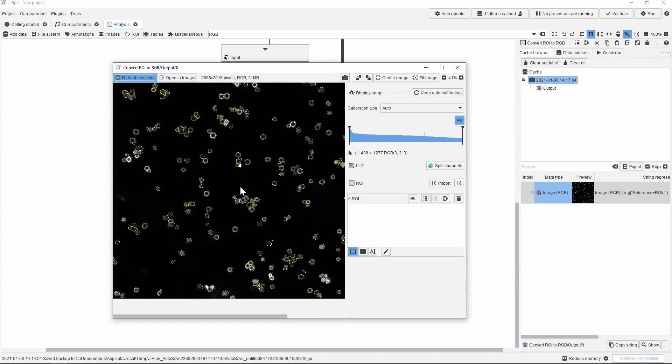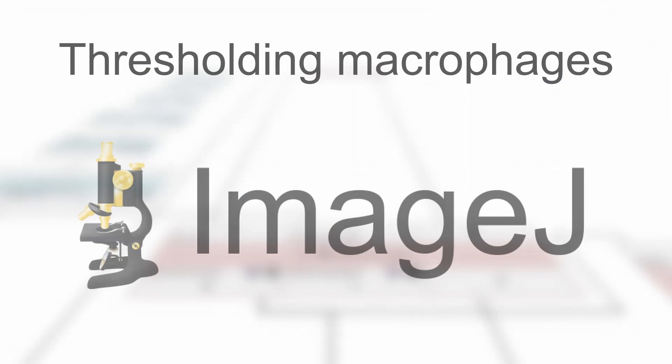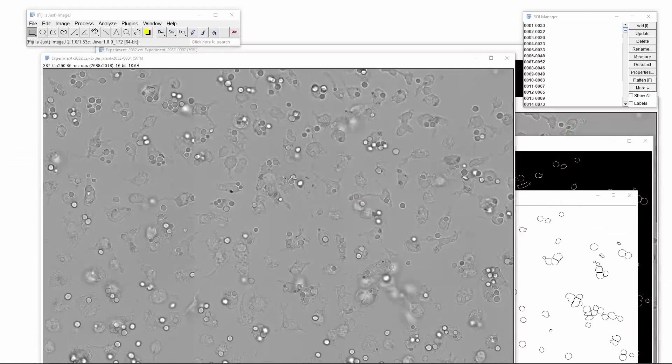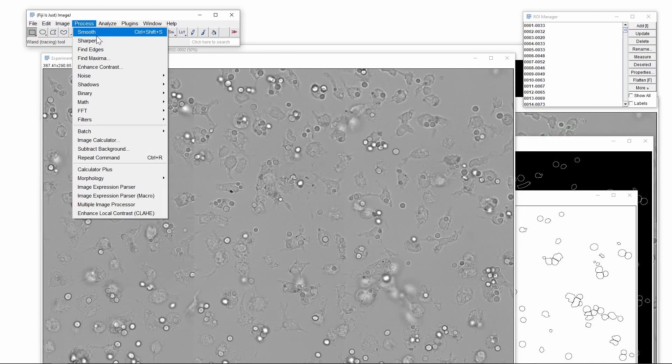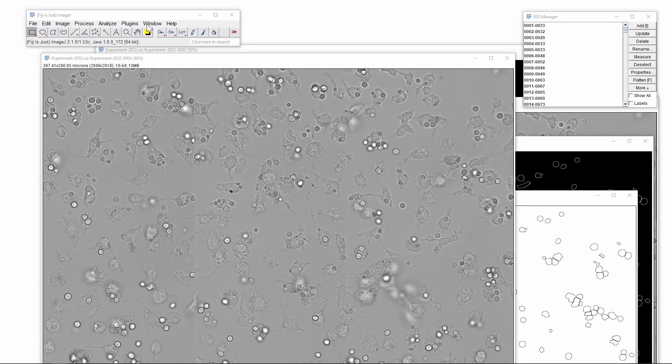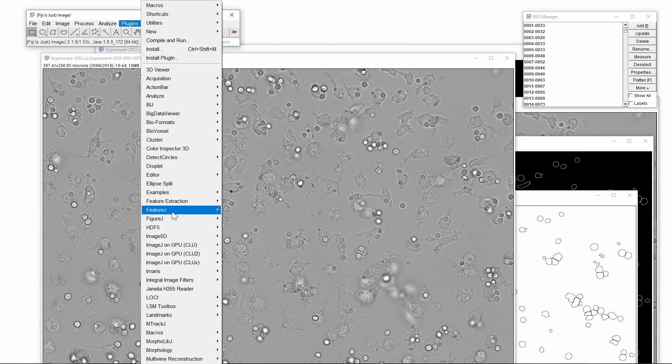So now we are ready to analyze the macrophages. For this one we return to the ImageJ platform. At first we switch back to the transmitted light image and then apply one step of sharpening. Because the macrophages were actually not labeled fluorescently, we have to use a little trick.